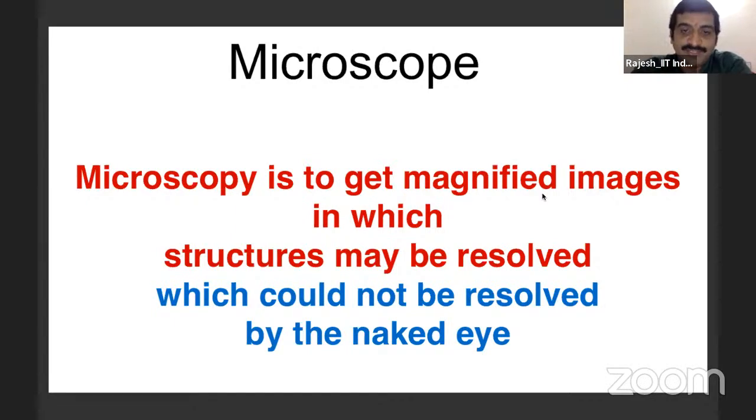That we will talk about. And this resolution of the microscope should be at a level which we cannot achieve through the naked eye, because of the faculty that we have, the naked eye, we can see. But how closely and how zoomed we can see, and how much we can resolve between things.